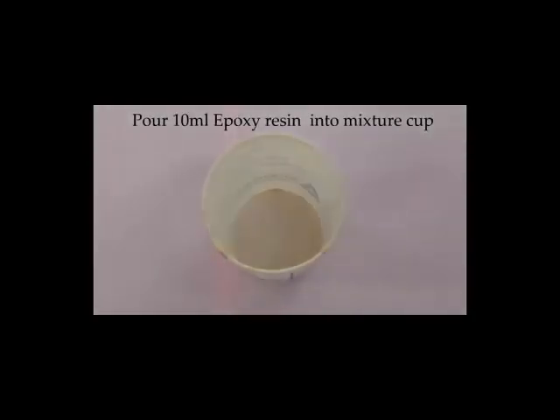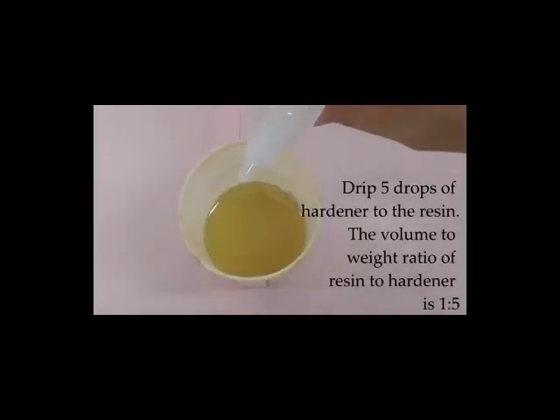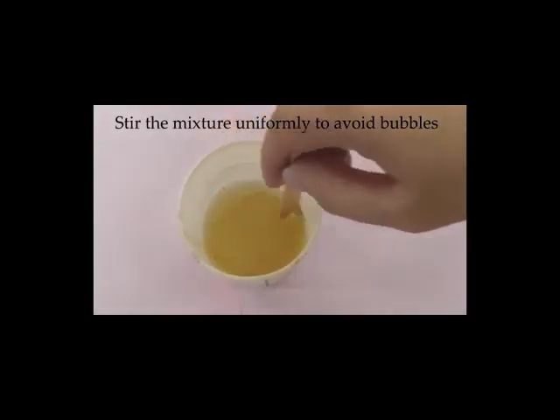Pour 10 ml epoxy resin into the mixture cup. Drip 5 drops of hardener to the resin. The volume to weight ratio of resin to hardener is 1:5. Stir the mixture uniformly to avoid bubbles.